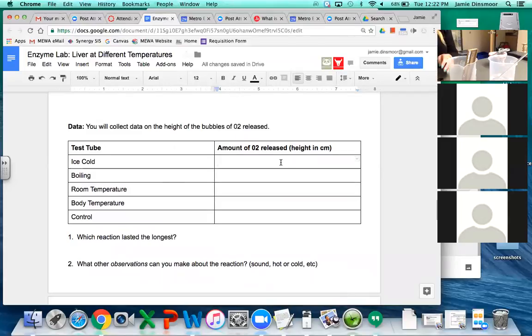Brand new hydrogen peroxide. By the way, this stuff actually goes bad, right? If you leave hydrogen peroxide, like let's say it's 5 years old in your house, it will break down into water and oxygen by itself, even without the enzyme. So that's why it has an expiration date, or it's supposed to. It's usually really tiny. So this one expires in 2019. So hydrogen peroxide does do this reaction on its own, right? It does break down slowly over time. Again, that's in 3 years, so you can't wait 3 years to get rid of poison from your body.